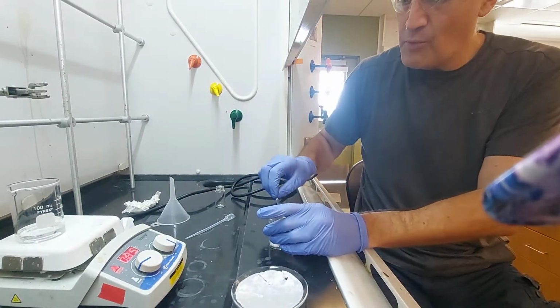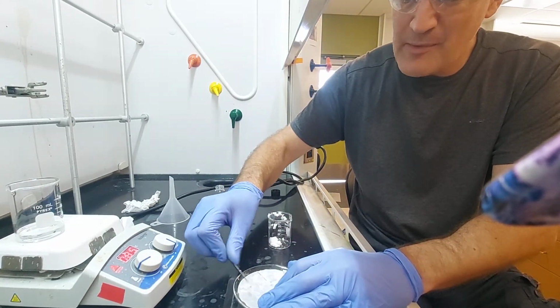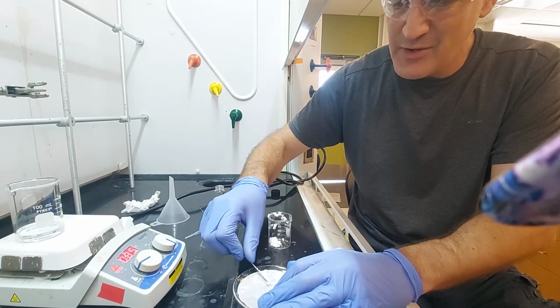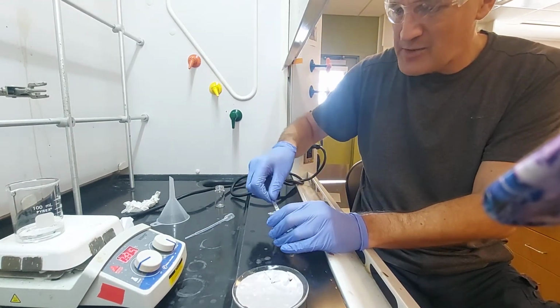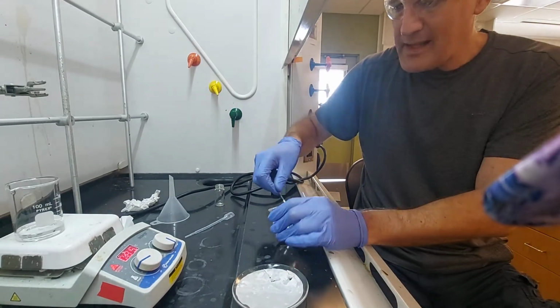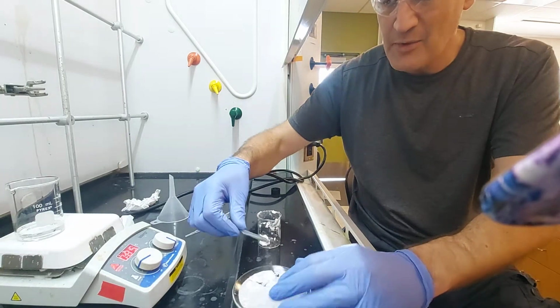Okay, so what I'm doing here is I'm just scraping this as best I can. Now you'll see that I'm ripping the filter paper a little bit here. This is a little tricky. It may happen to you too. Just do the best you can, okay? The issue of this stuff being on the sides, we will be able to get around that. That will not be a problem.